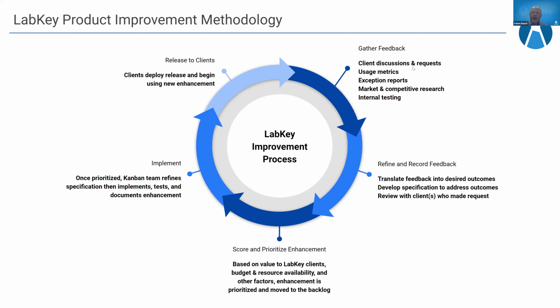We get feedback about this new enhancement. Is it working? Is it producing those desired outcomes? Could it be improved? Are there additional enhancements that we can make to make it better? We start getting that feedback and start the process all over.